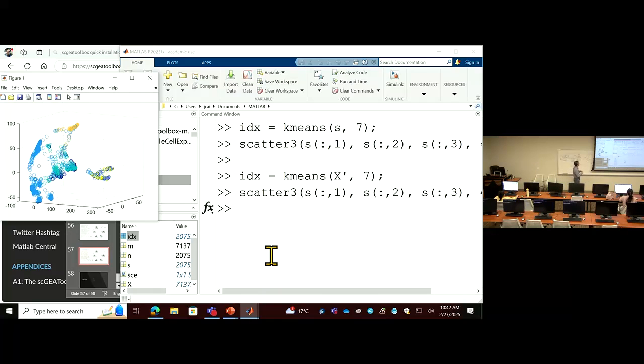You see some of these groups. This may be cluster number 1 occupying quite a lot of cells, and those cells are dispersed into several small groups. Well, there's a mixture of this in here.